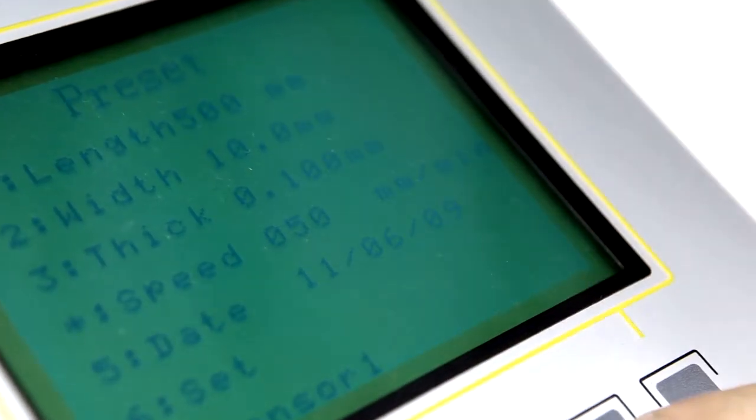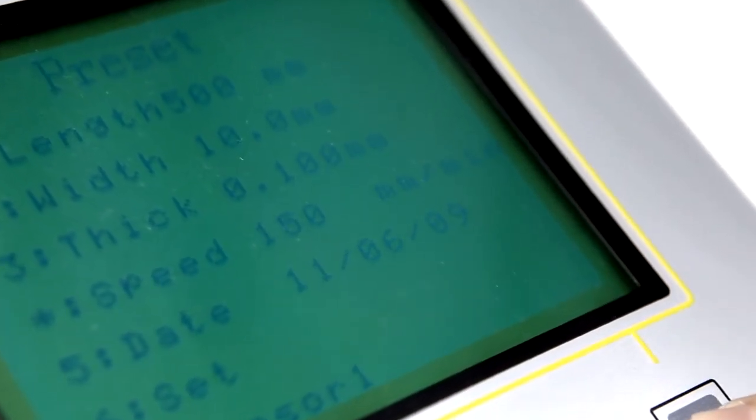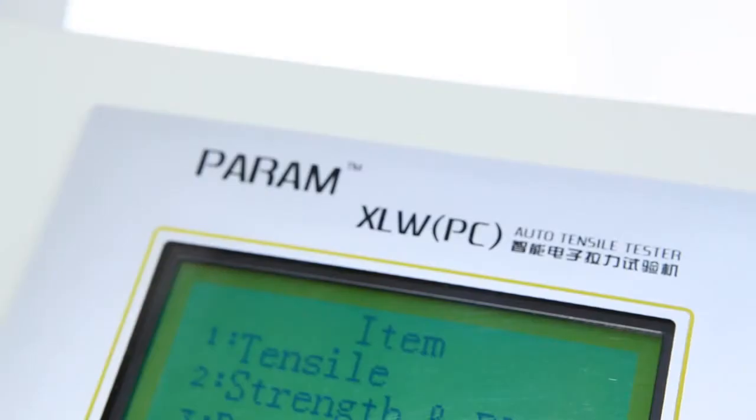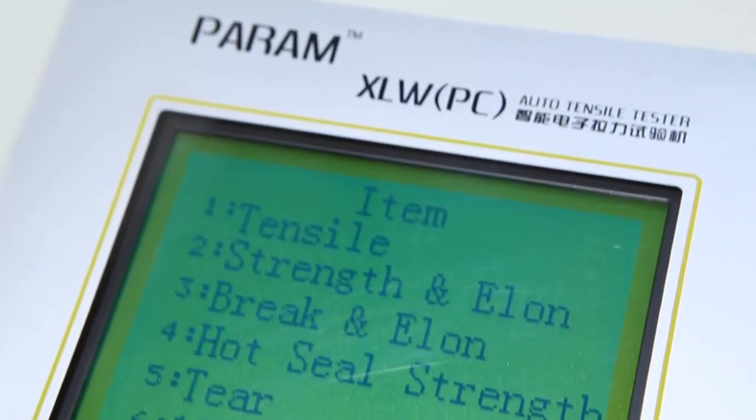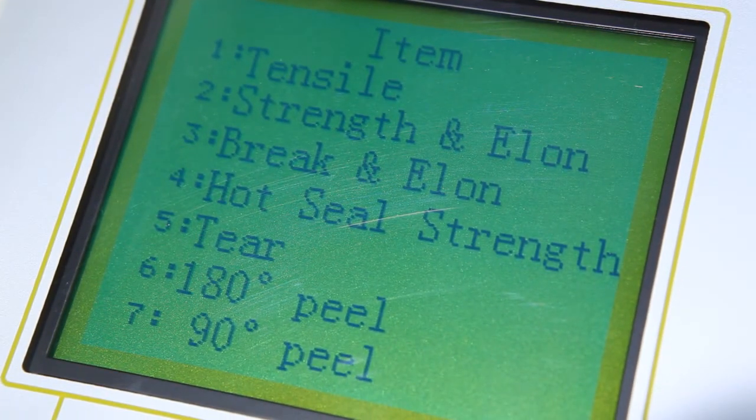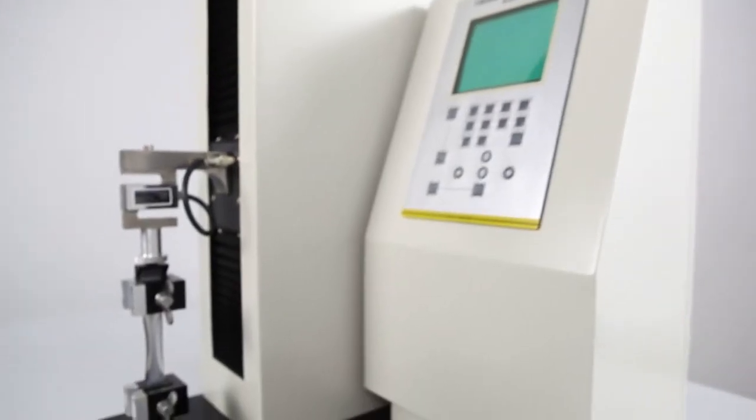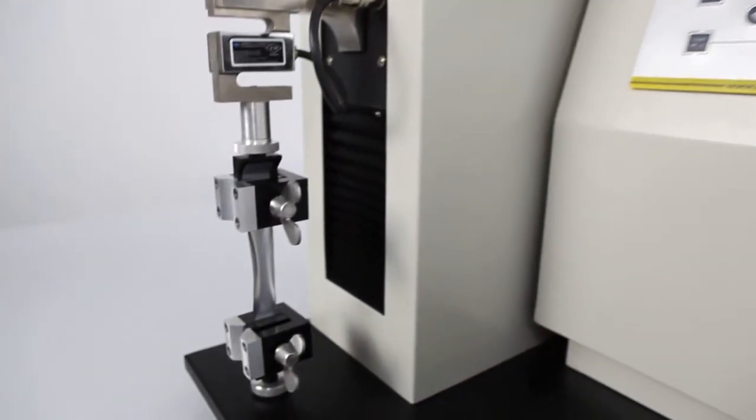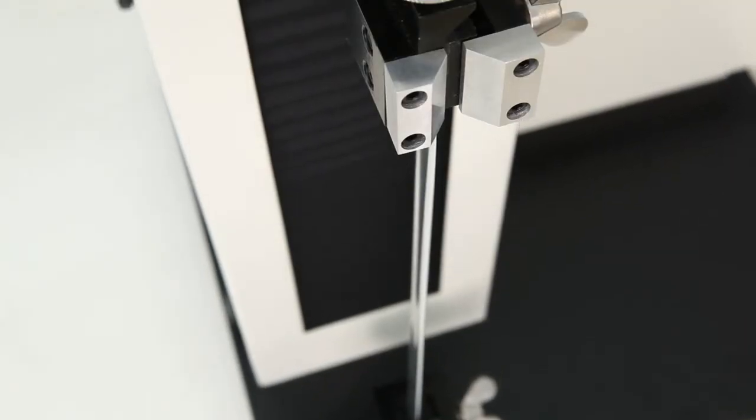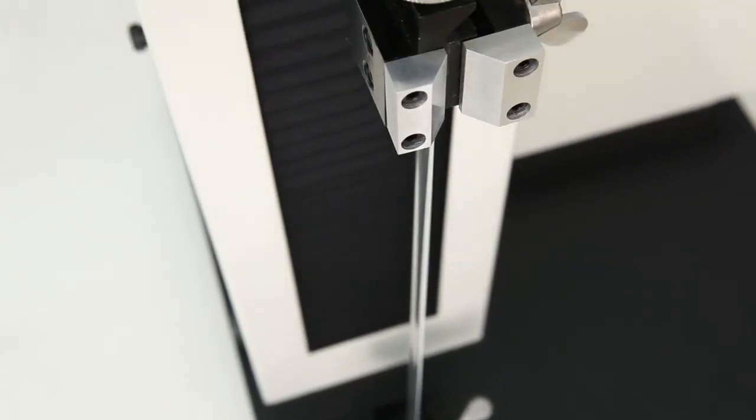This instrument can perform tests at seven different testing speeds that apply to different industry standards. They can be used to measure tensile strength, peeling force, tearing force, heat seal strength, and various other properties of packaging materials, and provides research institutions and manufacturers with the excellent solution for analyzing the relevant physical attributes of materials.